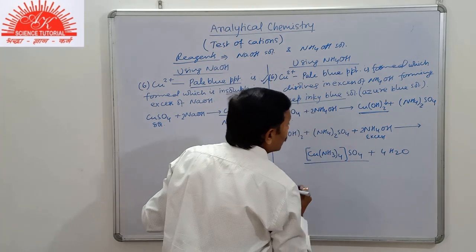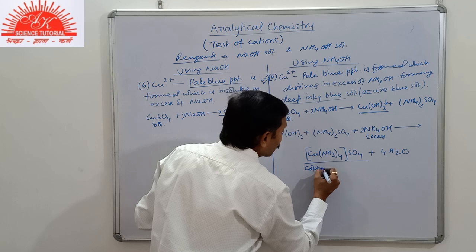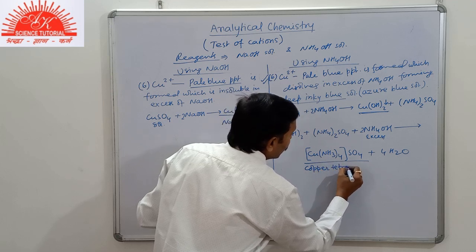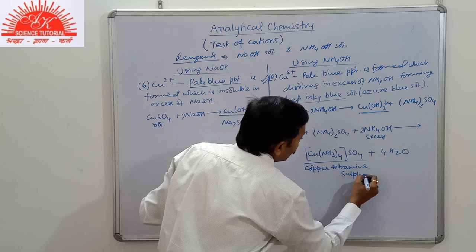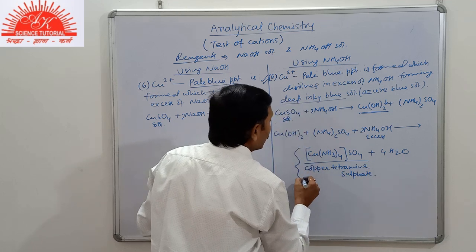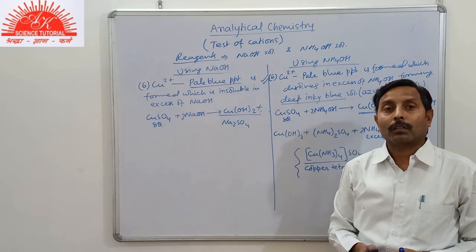Now this is the complex compound called copper tetraammine sulfate. So this is the compound present in the deep inky blue solution or azure blue solution.